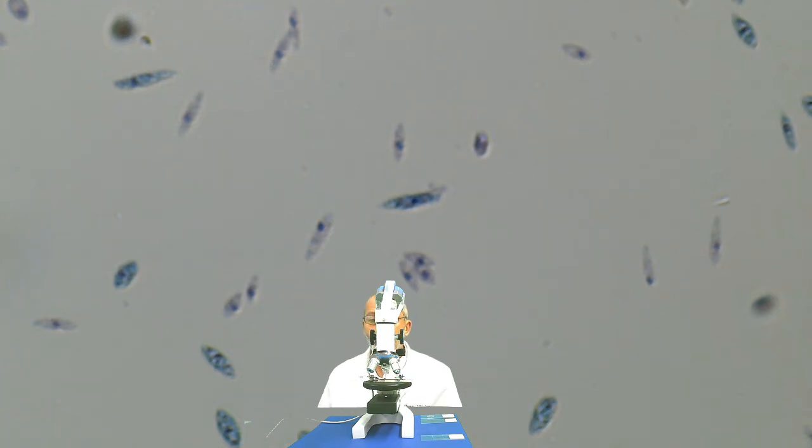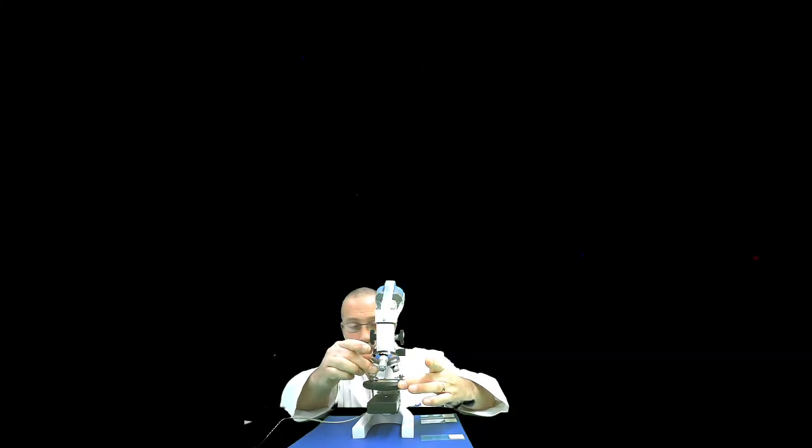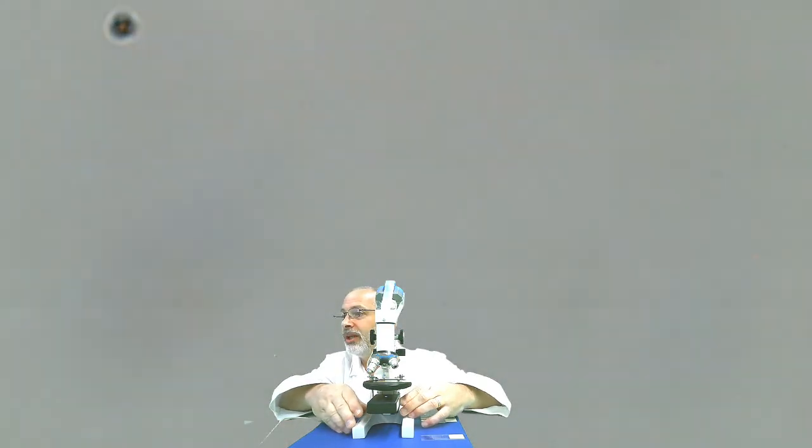Okay, that was 40 times magnification. Now let me head over to 100 times magnification. Adjust the lighting here.